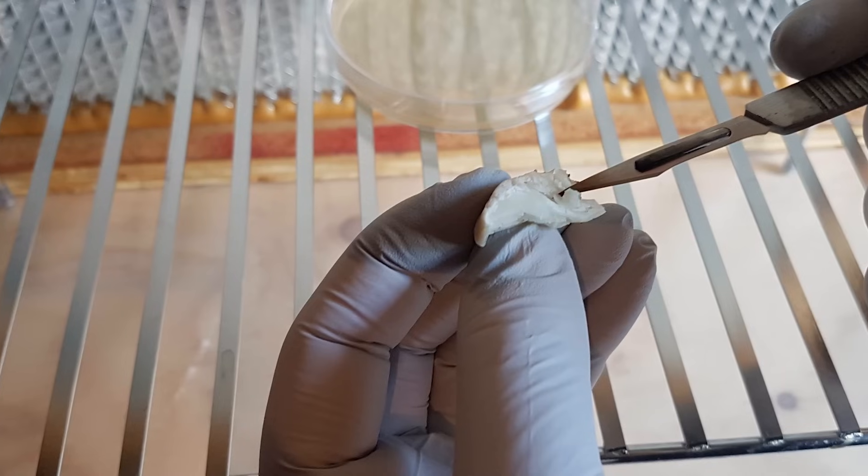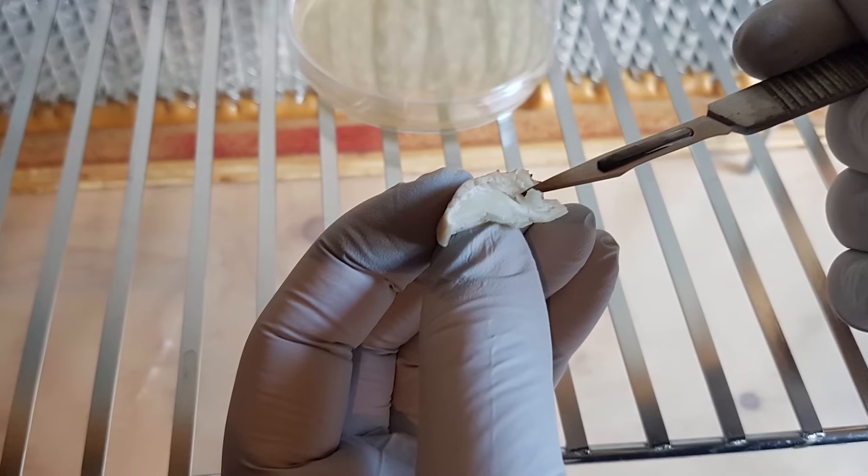One way to get culture on a petri dish is to take a clone — you take a fruiting body of a mushroom, cut out a little piece of tissue, and in a sterile manner place it on top of the agar, where it will start to grow out and form a mycelial culture. Another way is to use a spore swab — you swab some spores on the agar and eventually they will germinate, form mycelium, and you will have a bunch of different strains on agar. Keep in mind, starting from spores is a bit of a crapshoot — it might be awesome or it might not be so great.